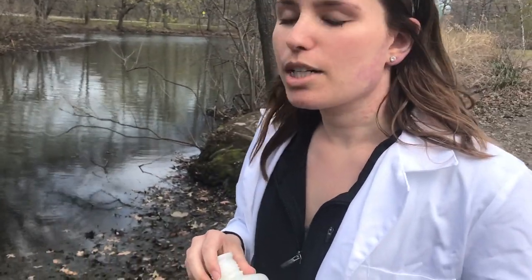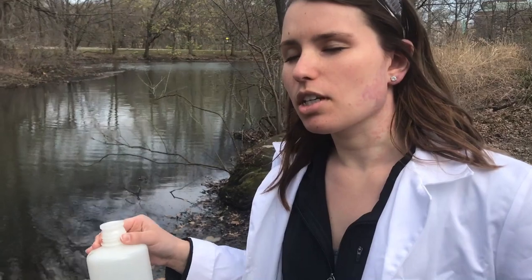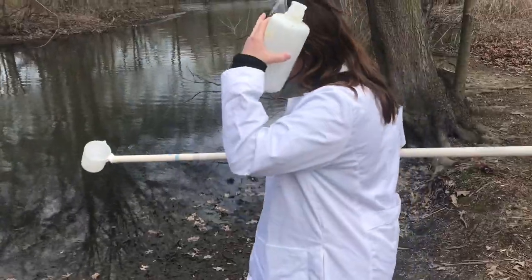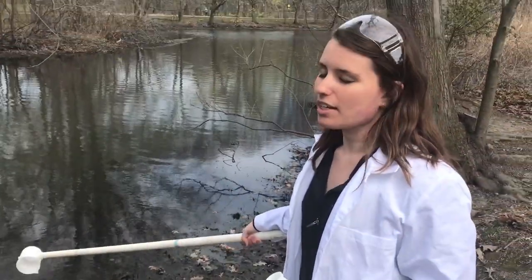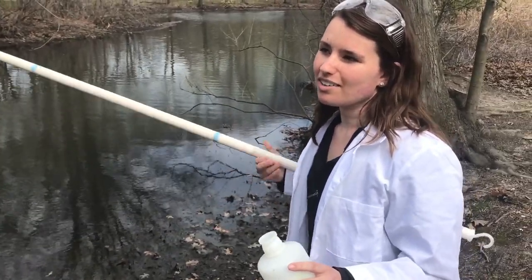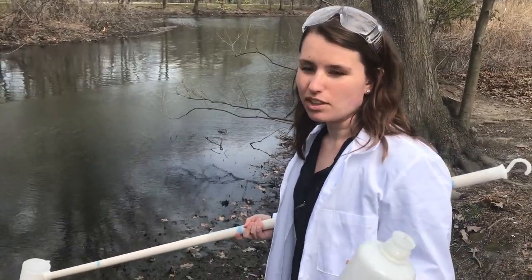Here comes the gross part. Usually we would have one person holding this and one person scooping the water, so it won't be as messy, but due to budget cuts I'm just going to do it myself. The most important part is that you don't want to disturb any of the sediment around — you want to get as little dirt as possible. This will help you filter less dirt with the Büchner funnel later.